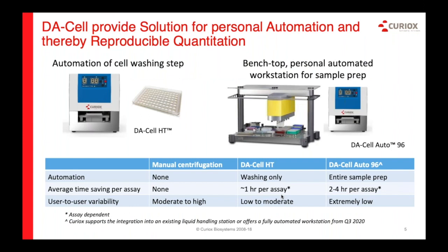At this point, you may think, okay, automation is really important in improving flow cytometry data, but I'm not ready to embrace a new technology. I want to automate what I'm familiar with, the centrifuge. And maybe you think you can build an inexpensive automation using the centrifuge. You're certainly not the first to come up with that idea.